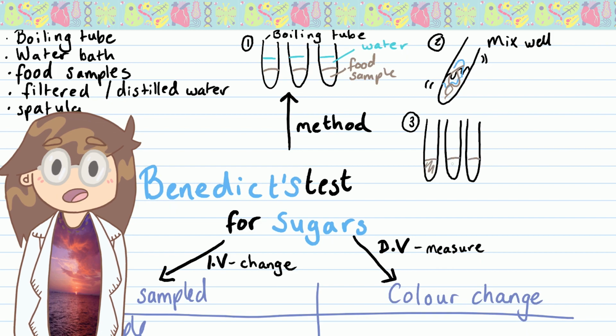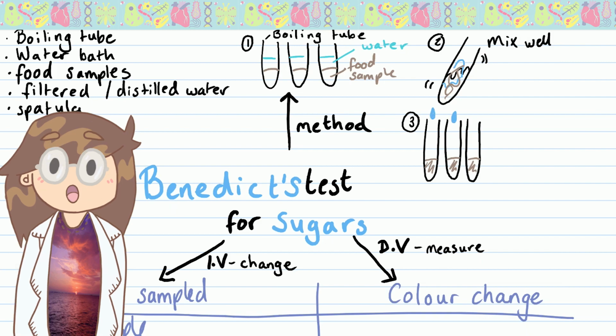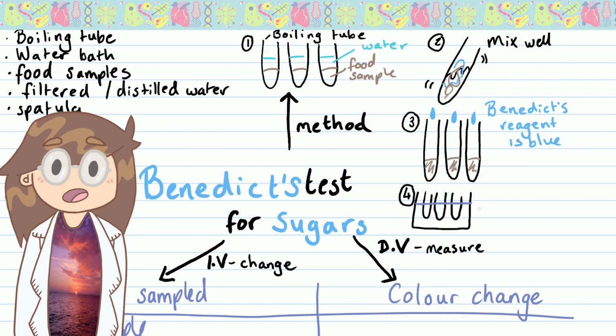You're going to put that into your water bath. It needs to be hot. The hotter the better, so about 95 degrees C. So it's really important, if you're doing it in school, you're always checking the temperature of your water bath water, and if it starts to cool, you add a bit more hot in. If you're lucky and your technicians are smiling upon you, you might be given a water bath that can be set and kept at 95 degrees. You leave it in there for about 5 minutes.